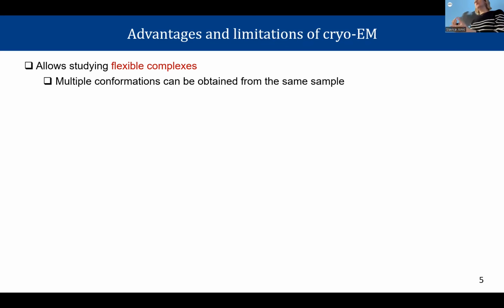In this case, we are speaking about X-rays. Here in cryo-EM, we speak about electrons. But it is not only this. In cryo-EM, we don't need crystals. As I said, we cryo-freeze the sample, but you have vitreous ice, so this is not a crystal.